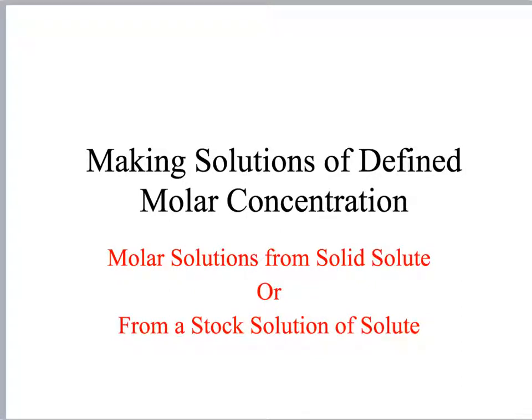Okay, this is a quick video to talk about making solutions where we know the molar concentration of the solutions, and we're going to do it two ways. We're going to make it from solid solute, and we're going to make it by diluting a stock solution of the solute. So I will show you both ways. We're going to make identical solutions, one starting with solid solute and one starting with a stock solution of the solute.